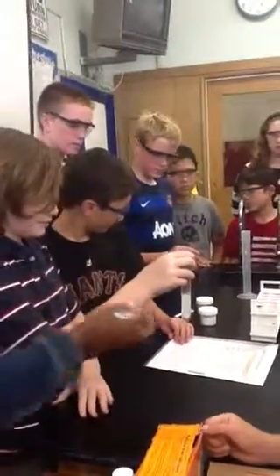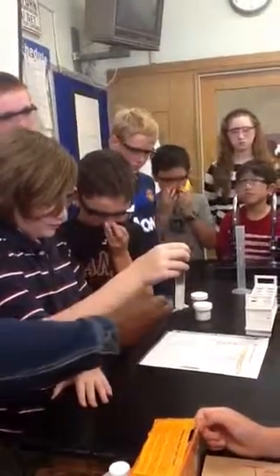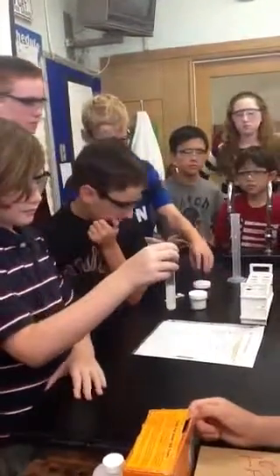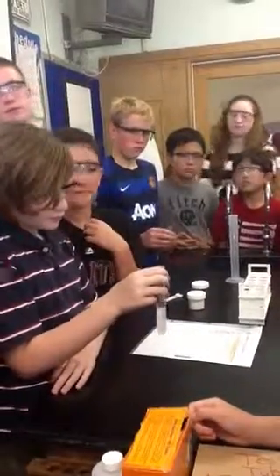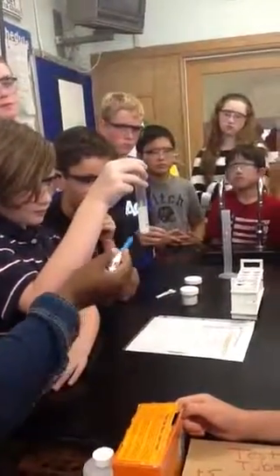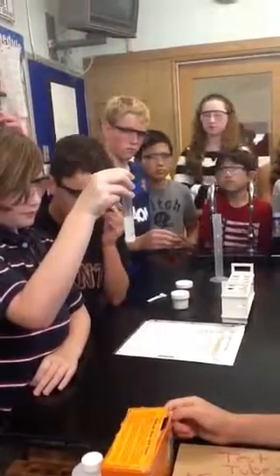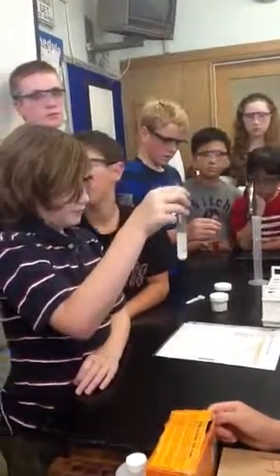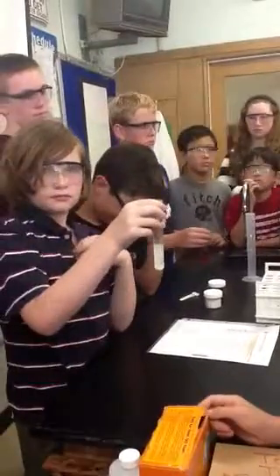Okay, so some of it sunk, some of it is still floating at the top, and then it's cloudy in the middle, so some of it is in the middle. Some of the substance in the middle might settle, or it might stay right where it is. So last year, you can use water in a substance, and if they separate out in different levels, what do we call that? You did this last year. When you have substances that might have different densities that separate out.